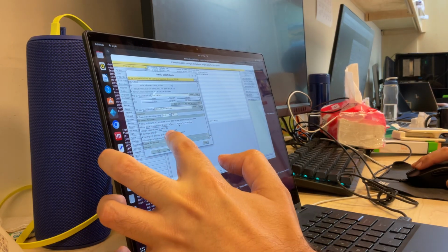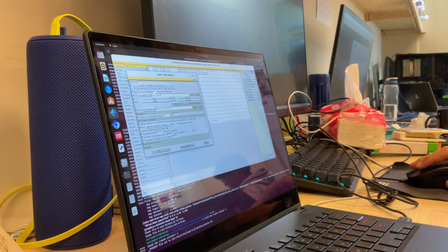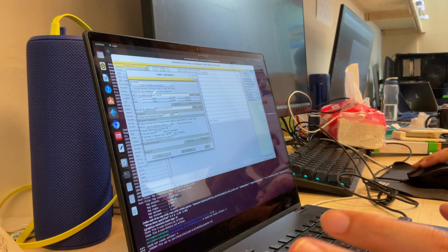Okay, so then the next thing is you use scale and anisotropic B factor. You apply Wilson scaling. Remember, Wilson scaling is from the Wilson plot. Okay, and you weigh the observations by their SDs, so that's the standard deviation. So strong peaks with low SDs will be more important than weak peaks with large SDs. Okay, and that's it.